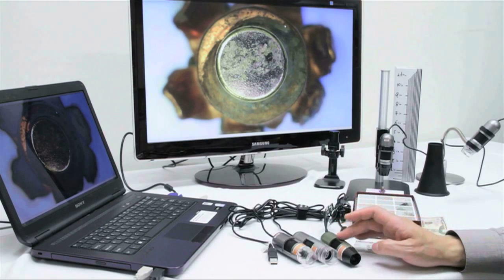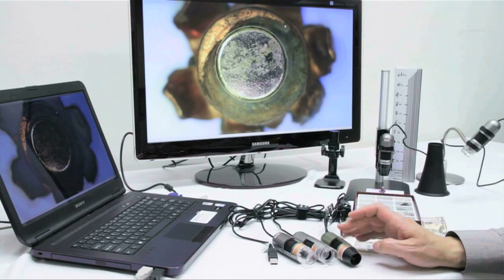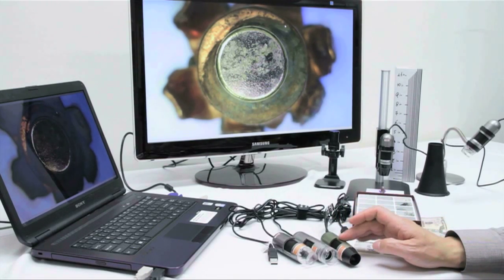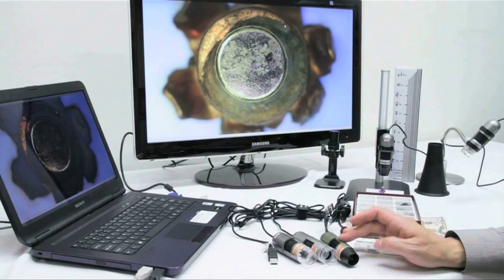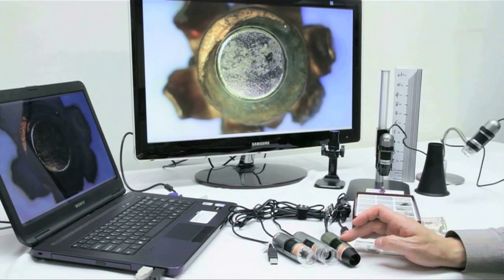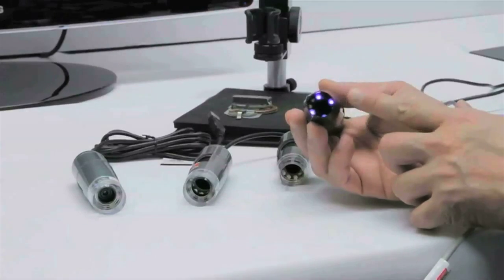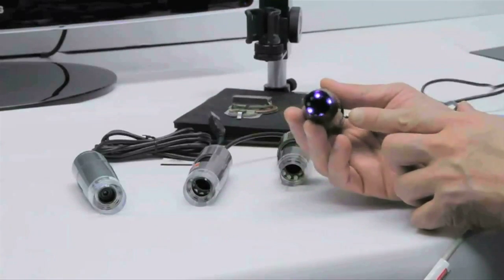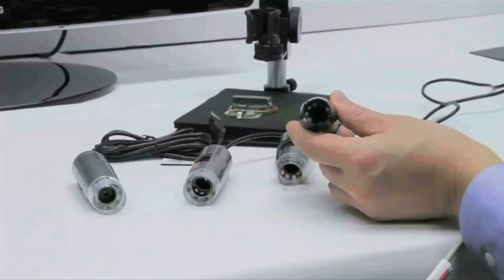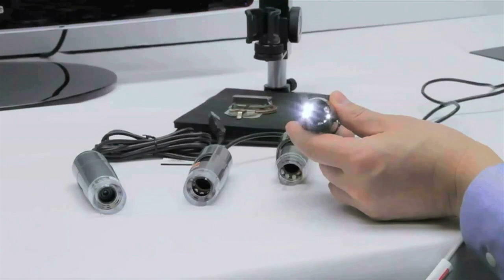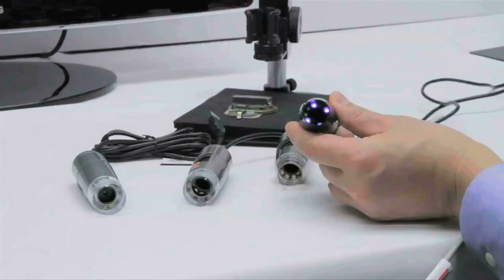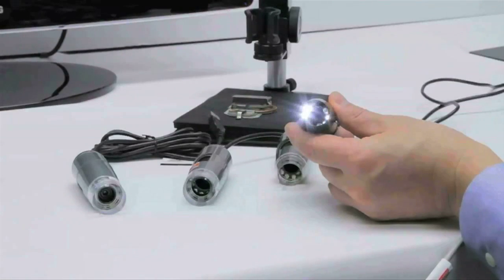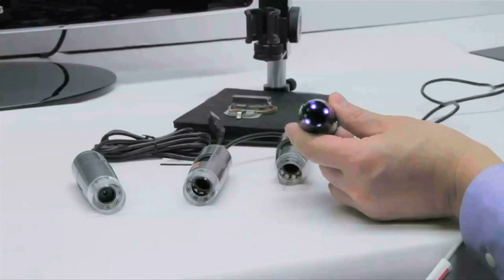And then last but not least, the one that we have over to the very far right is 4 white LEDs as well as 4 UV LEDs, but the difference with this one is the LEDs are tuned to 375 nanometer wavelength, opposed to 395.